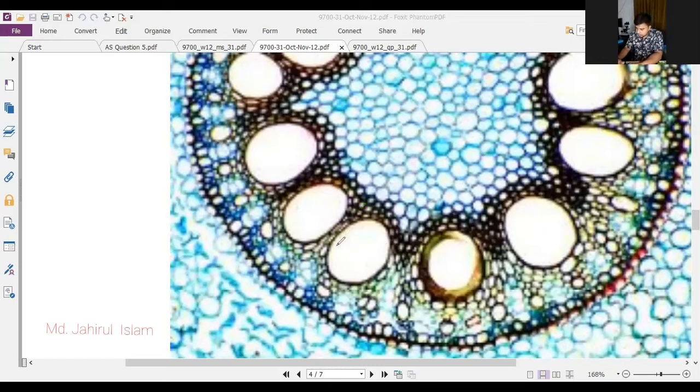Okay, first I select this cell and draw it. Actually it is very difficult, because it is annotated difficult. Then I will use another inner line to show the cell wall, and then I will draw these 3 touching cells.